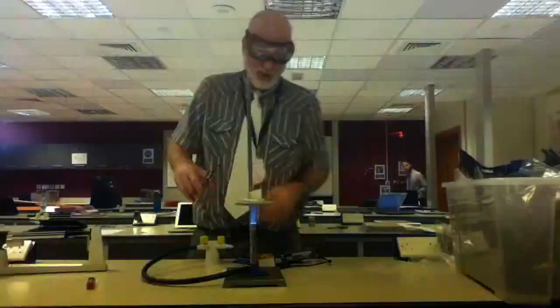Oh, is somebody doing it? Okay, thank you. All right, so this is what you're heating, right? Now do you see that the inner cone is right there? Do you see that it's right under the pot that you're boiling? You see that? Yes or no? Anybody not see it? Okay. You see? Right there.